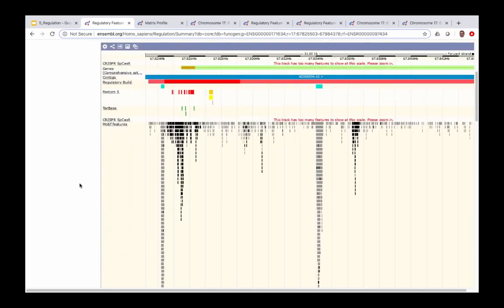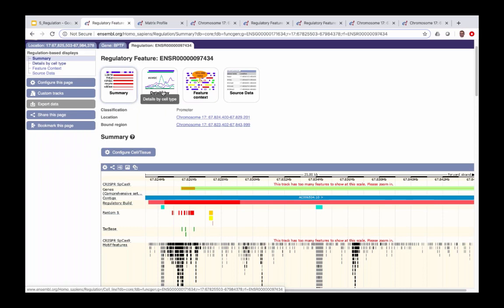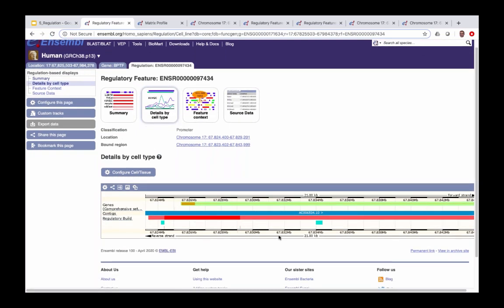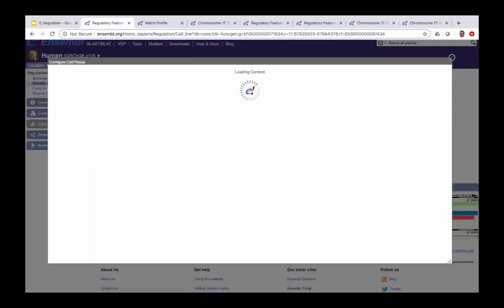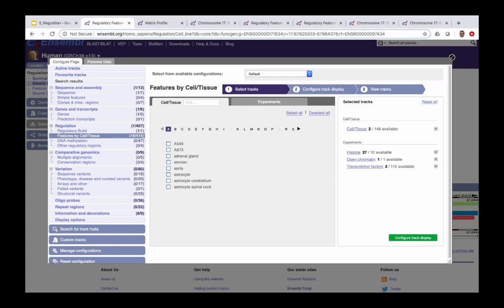To get more information about the underlying data for this regulatory feature, we click the link called 'Details by cell type'. On this page a small amount of data is displayed by default, but we can add data for different cell types by clicking the blue 'Configure cell/tissue' button. This opens a pop-up window that allows us to select our cell types of interest and the experimental data we want to see.